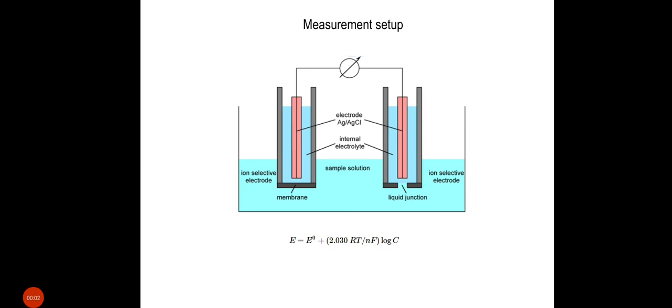Welcome student. In the last video, I discussed the measurement setup of the ion selective electrode. Now look at how this ion selective electrode works.